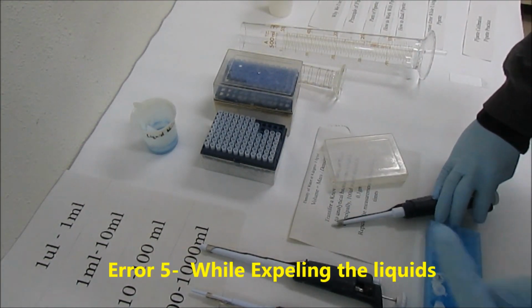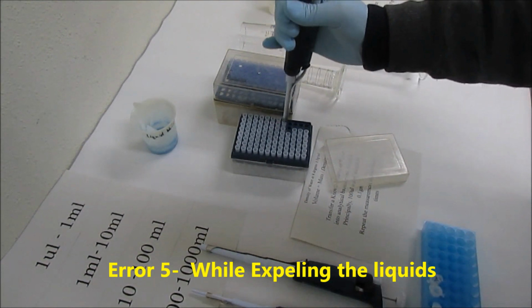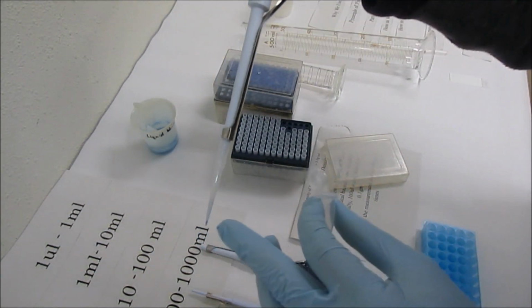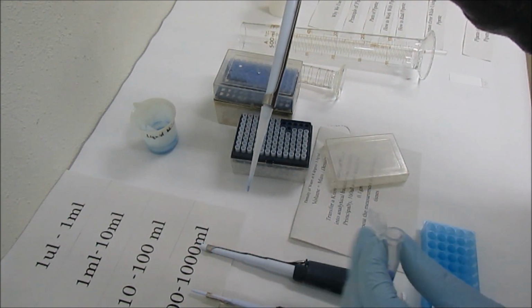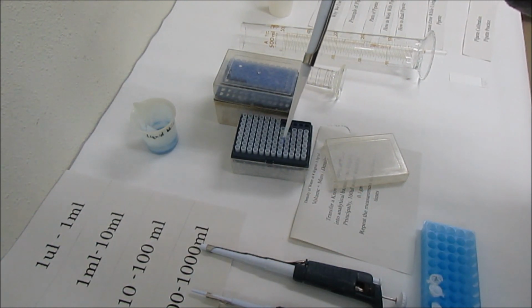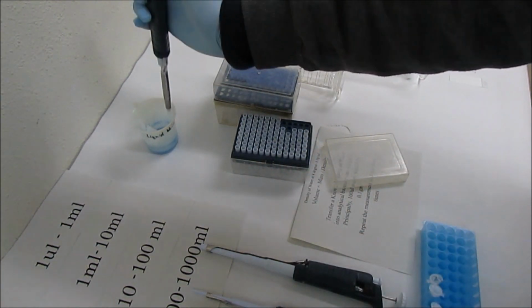And the fifth one, expel the liquid properly. Many times you just release, but the liquid is still there, right? So every time you have to see whether the liquid is completely expelled or not. Forcefully use the second stroke, right? Always see whether your liquid is completely out or not.